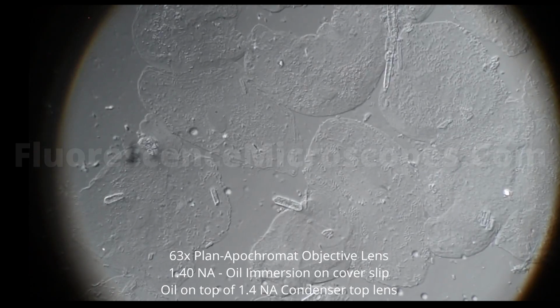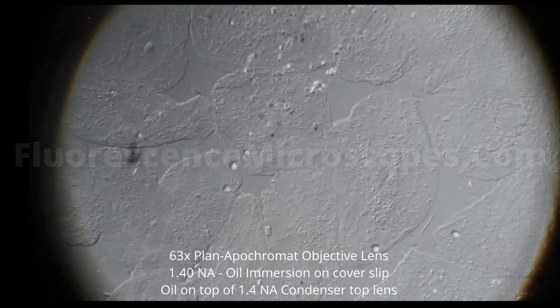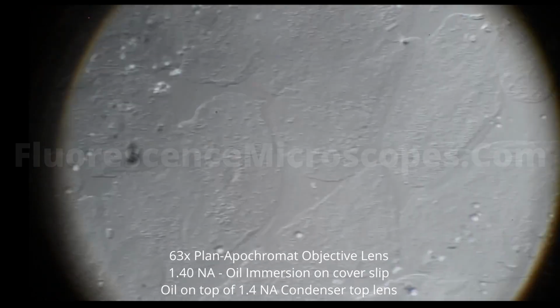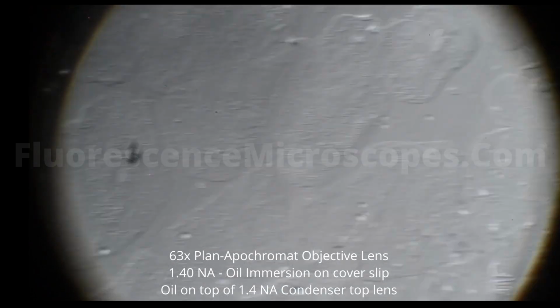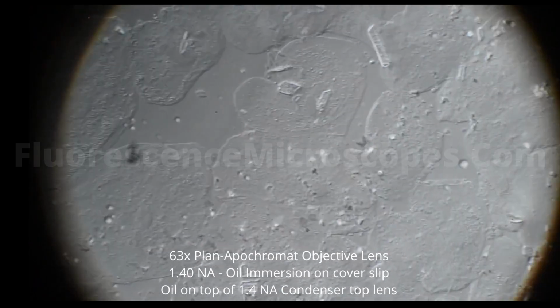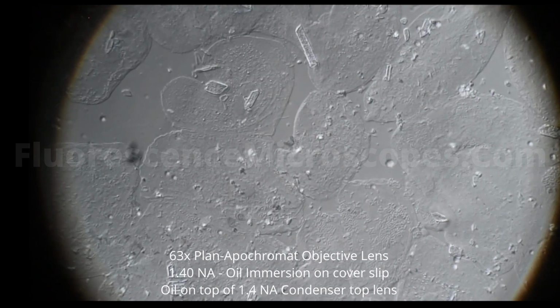Normally condensers are 0.9, and that's fine, but if you want to get a little more resolution out of your objective lens, on something that's a 1.4 numerical aperture or a high numerical aperture objective lens, then it's better to use an oil immersion condenser. You want your condenser to be a higher numerical aperture than your objective. In this case, the maximum we can get is a 1.4.